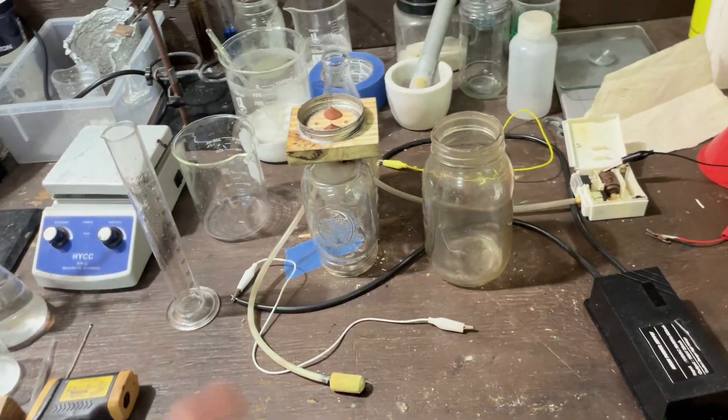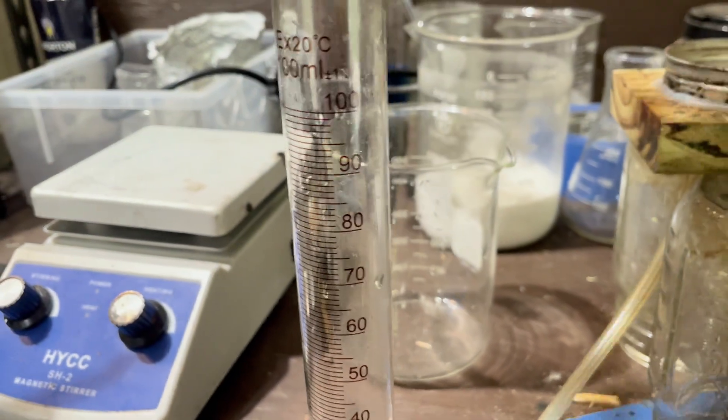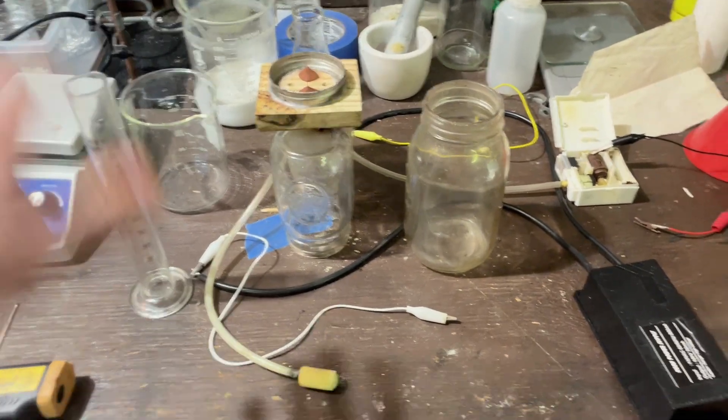So I'm going to be doing that. We're going to fill up about 80 milliliters of water in here, and then we're going to set up the whole apparatus, and then we're going to turn it on.